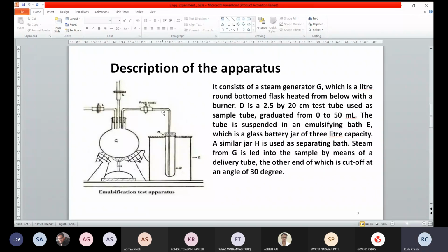Means you will start with 20 ml of oil, and on bubbling steam, you will see that the volume of the contents in the boiling tube turns into at least 40 ml, say 37 to 42 ml. And once that has been done, you will remove this delivery tube from the boiling tube, and you will pour it into a beaker containing room temperature water.